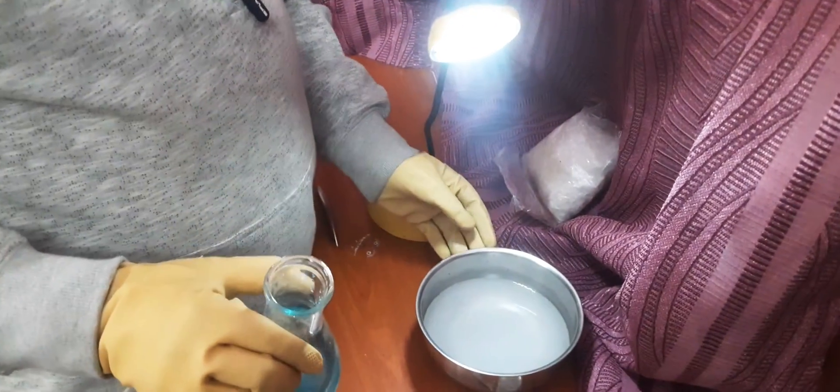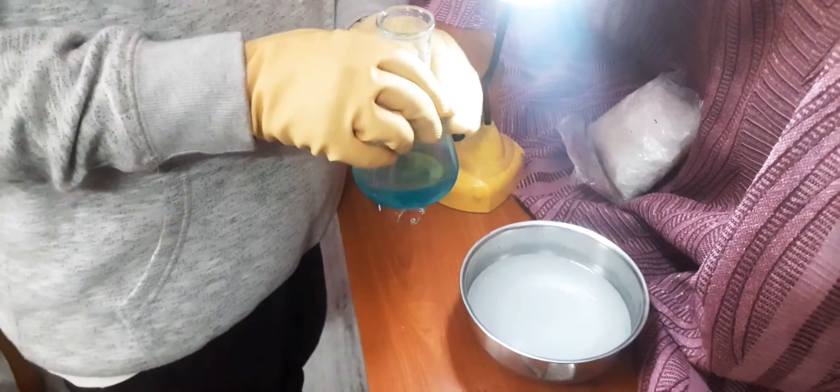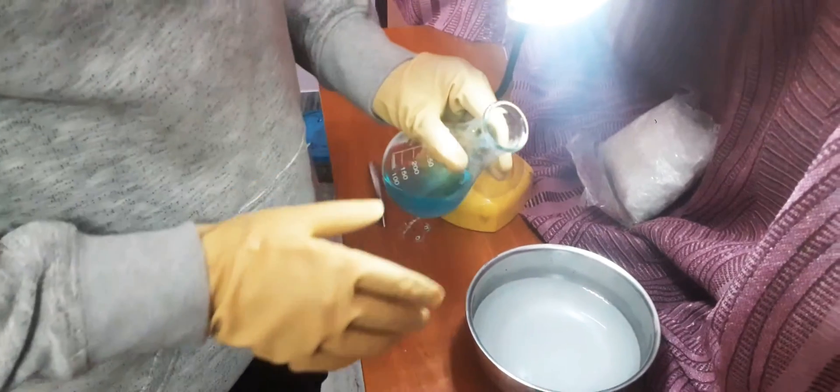The sodium hydroxide is quite well dissolved in the water, so we are going to start with the experiment. Watch carefully when I add copper sulfate into it.